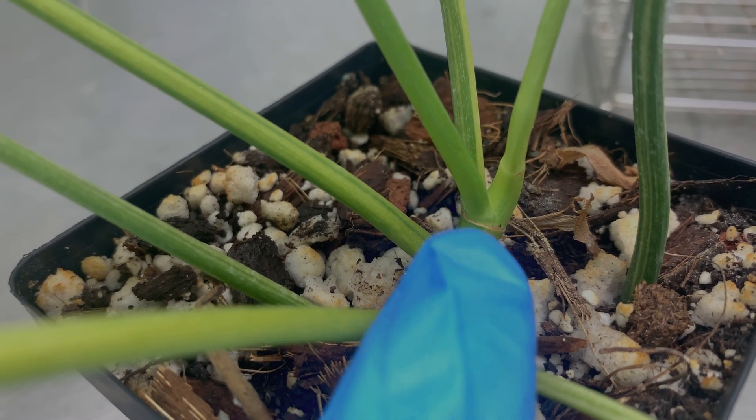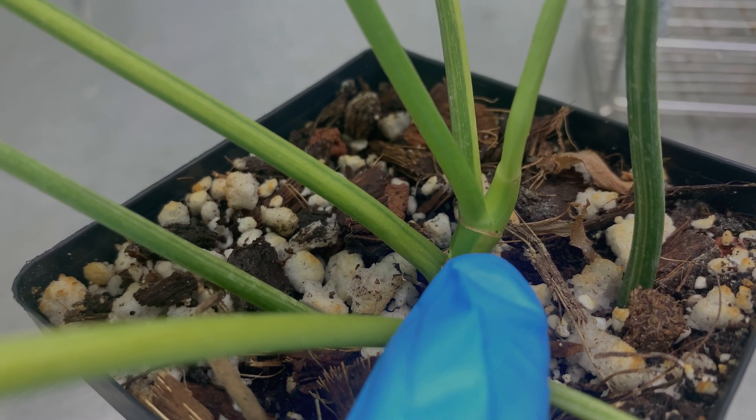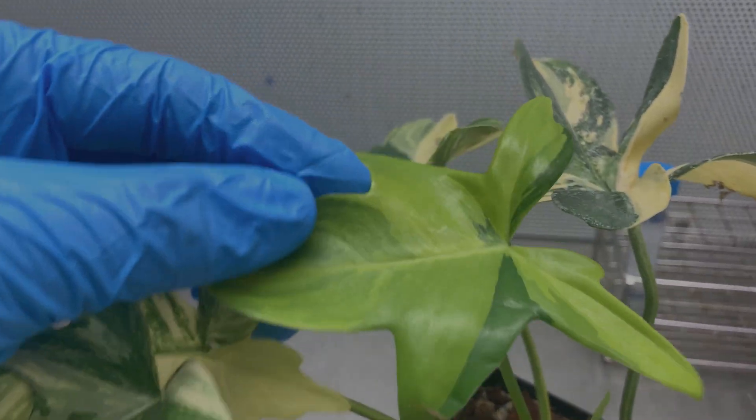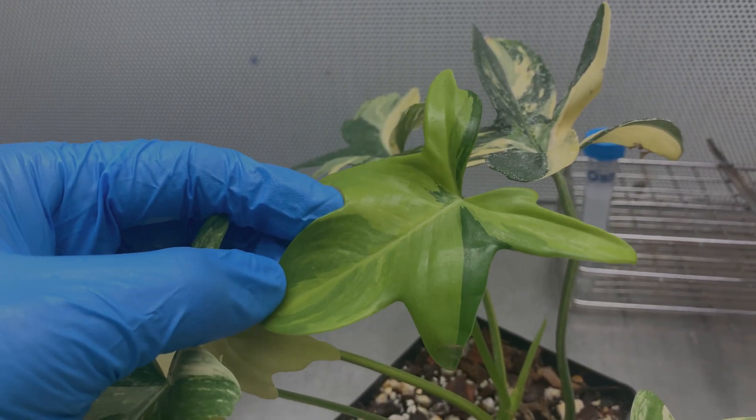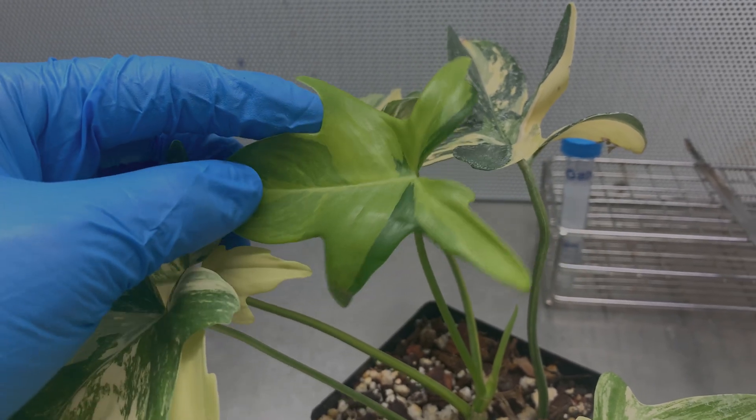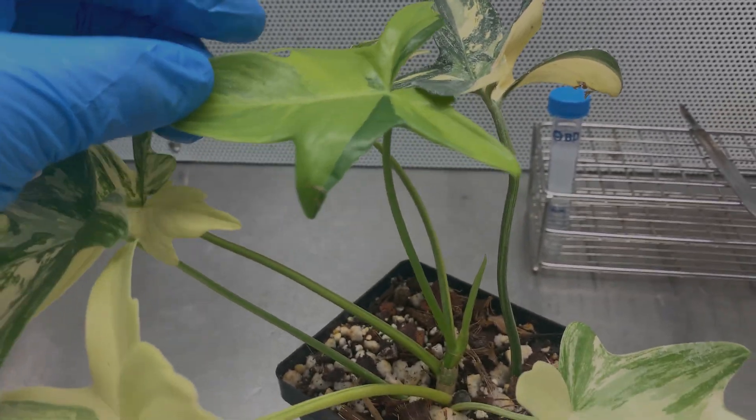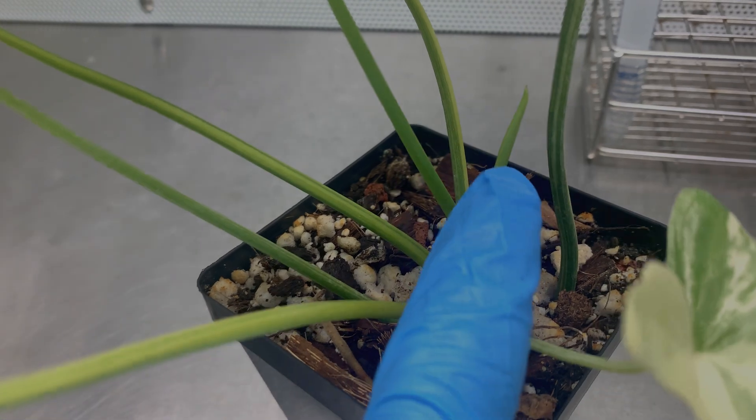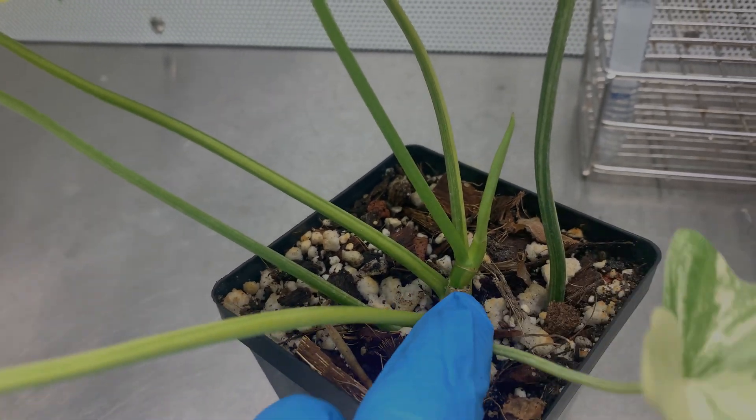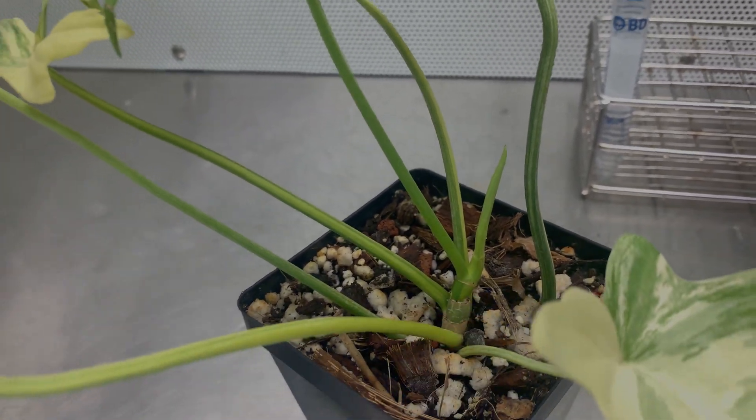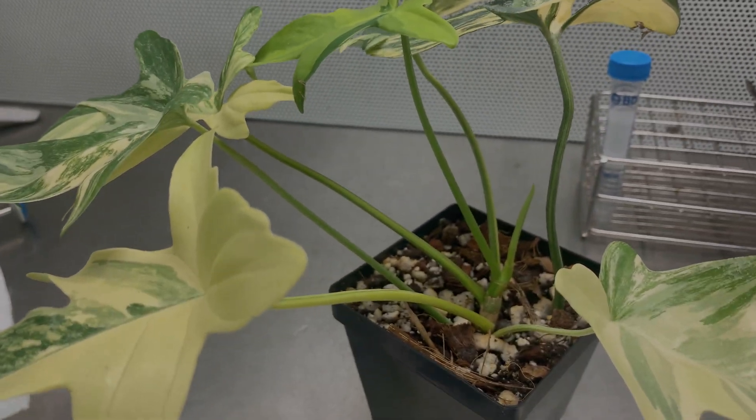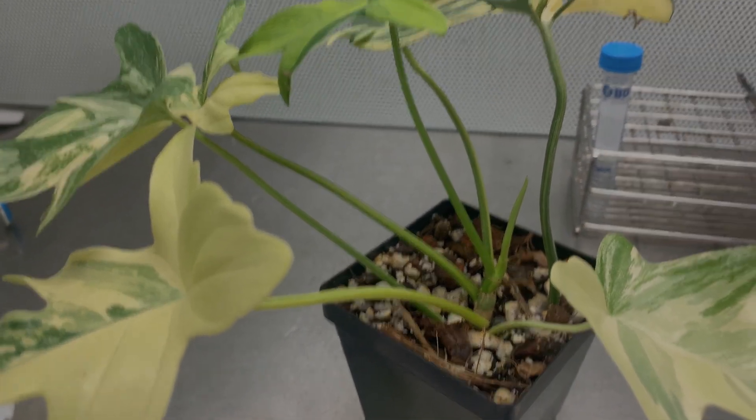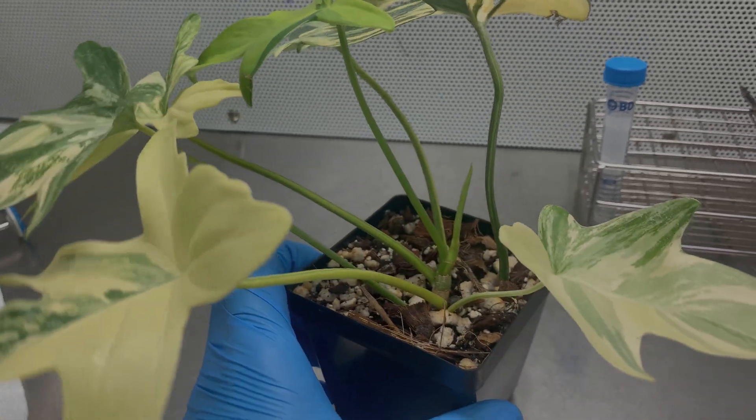So what I want to do is cut right here. This is the new leaf which is a really nice pink. Unfortunately I have to sacrifice it. I'm going to cut this part and this part, and this is going to be my culture. I want to leave the rest of the plant. I don't want to take as much material. I think that's enough for me to place this plant in tissue culture.